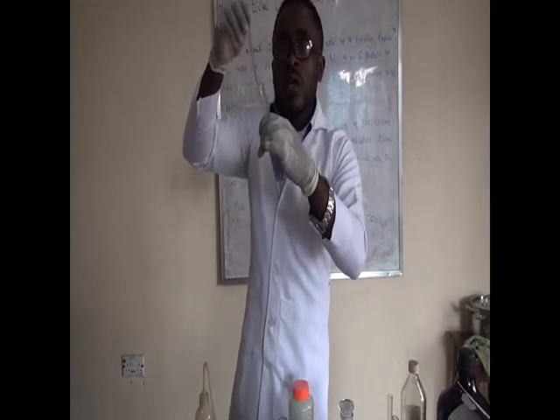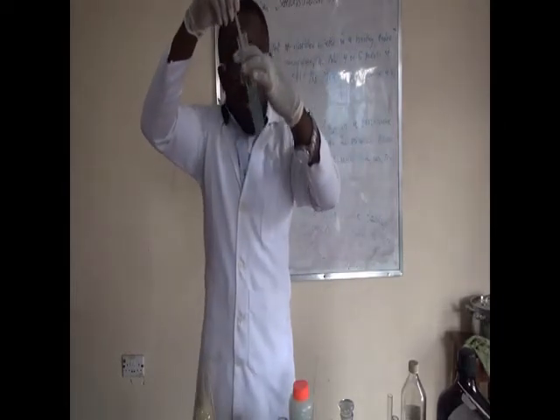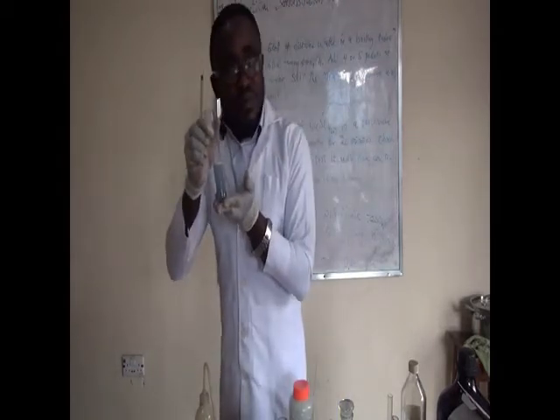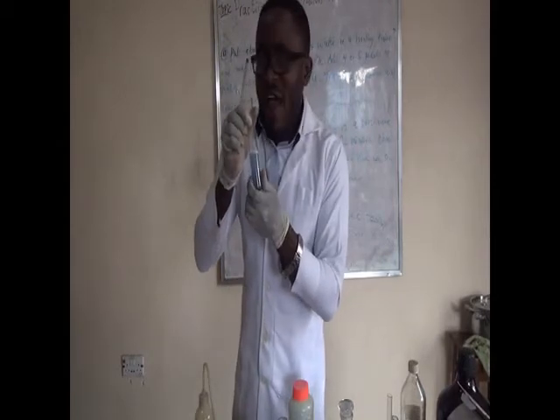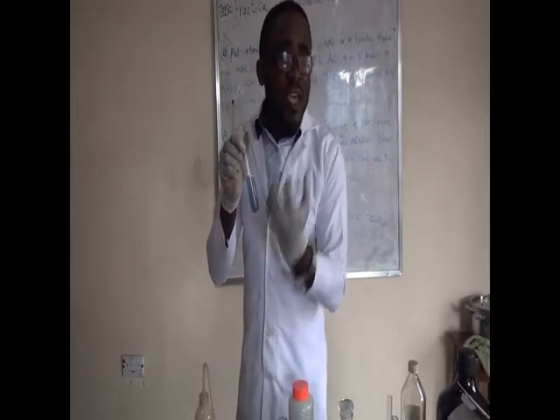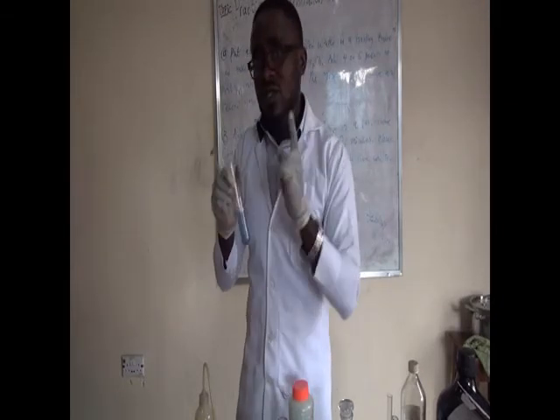One of the factors you consider when you dissolve a compound in chemistry is that you must stir it, and when you heat, it will dissolve quickly. As I'm stirring it, it's dissolving. That's your observation. Another observation is that you touch the bottom of the test tube, and what do you find out? It's very hot, as if heat was applied to it, but there was no heat applied to it.